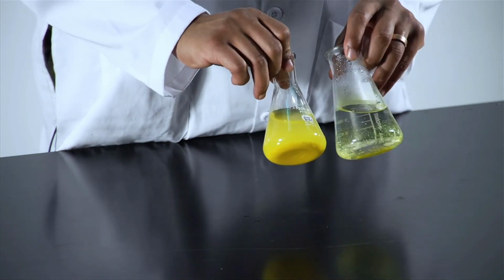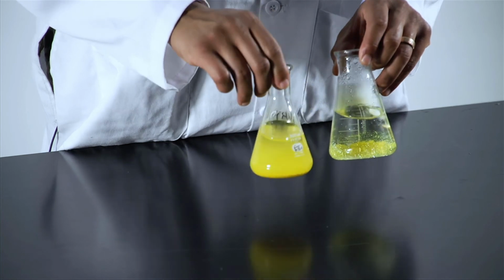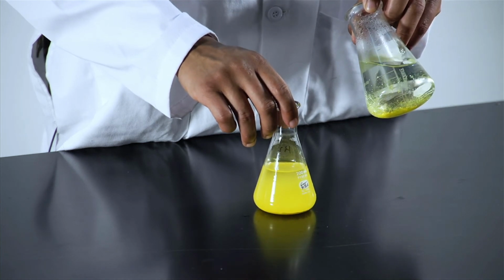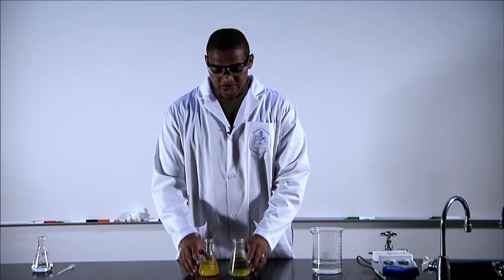So you can see the difference here between the formation of the products at room temperature, as well as the recrystallization of the products after it was dissolved in solution. So again, this shows you key stark differences in how crystallization happens in solutions and how that can be affected by solubility and temperatures related to the reaction.